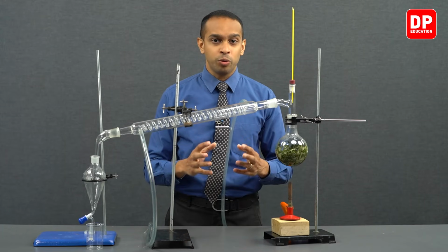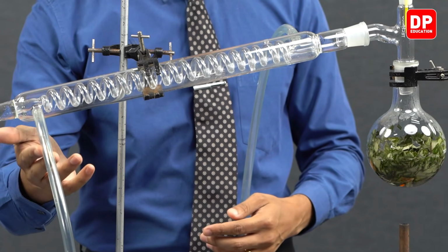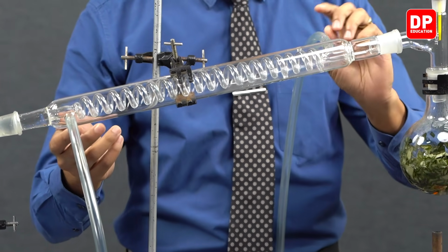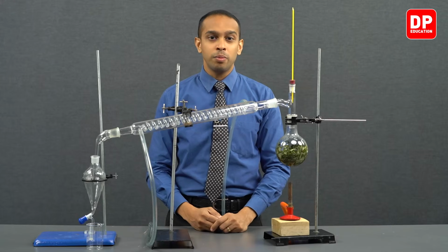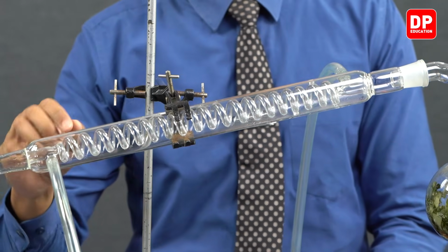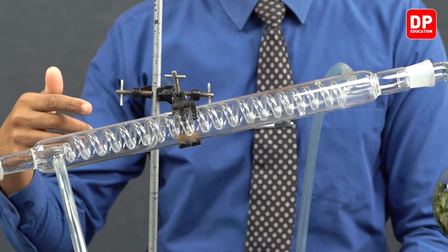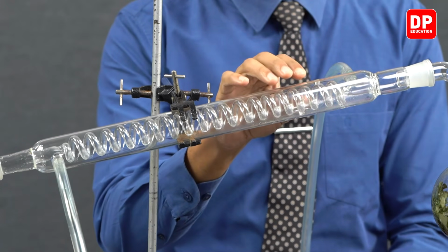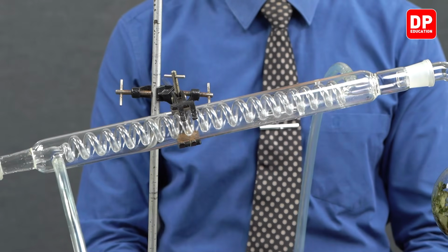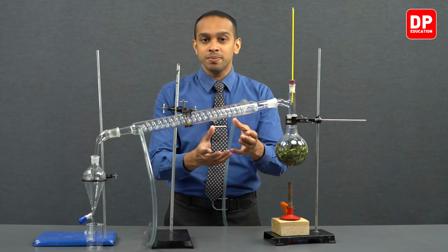So students, we have now observed why we use this particular setup to carry out this extraction process. And one of the questions you will be asked is why we fill in water from the bottom of this condenser and why is water removed from the top of the condenser. Now you will observe sometimes if you start filling water from the top of the condenser, due to gravity, the water will be removed from the bottom of the condenser faster, leaving some air bubbles or air gaps in the top part of the condenser, which will actually create a bit of an inefficient cooling system.